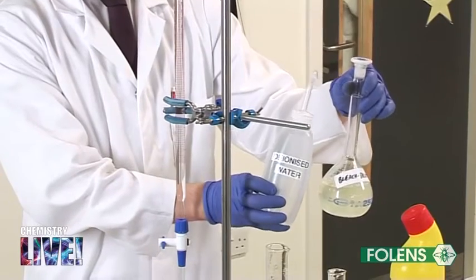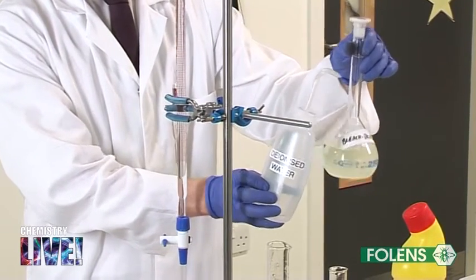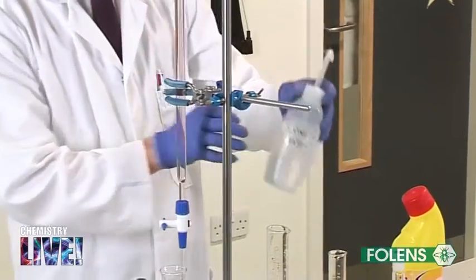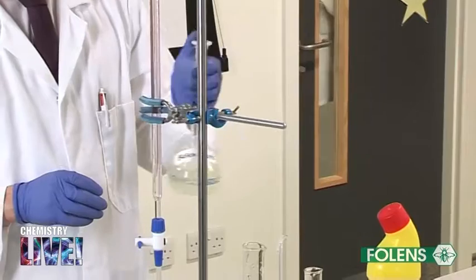Deionized water was added to the volumetric flask and made up to the mark. Note that we have diluted the bleach 10 times. The stoppered flask was inverted about 20 times.